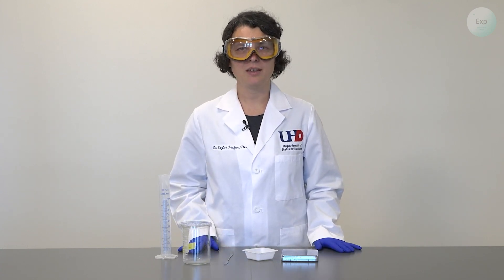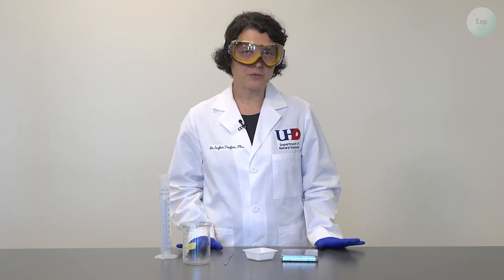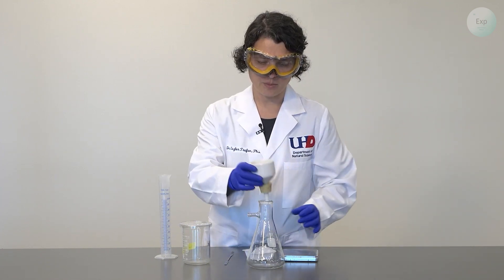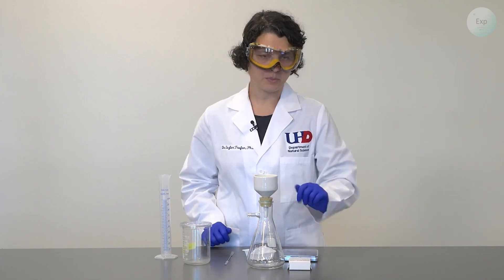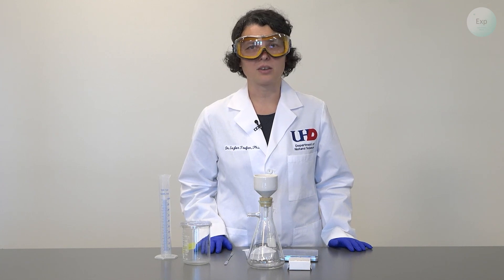There will be some filtration, and depending on the equipment available to you, you may do a Buchner filtration or a gravity filtration. For the Buchner filtration, should you go that route, you will need a Buchner flask, a Buchner funnel, the appropriately sized filter paper, and you will also need a rubber hose along with a vacuum connection.